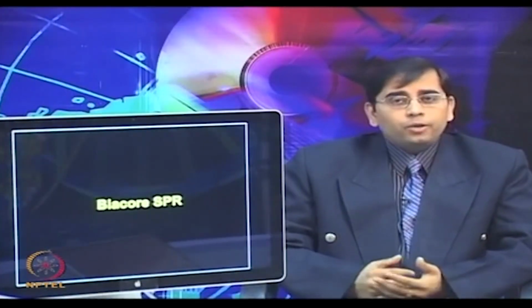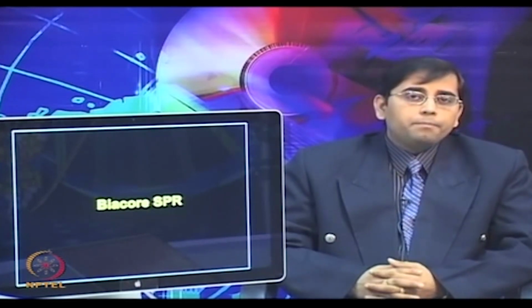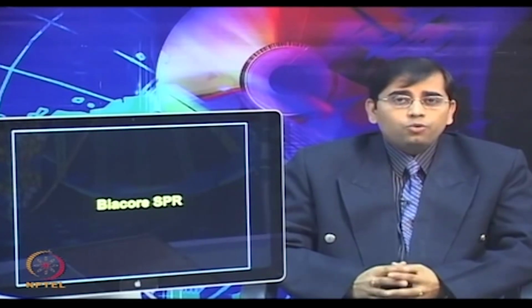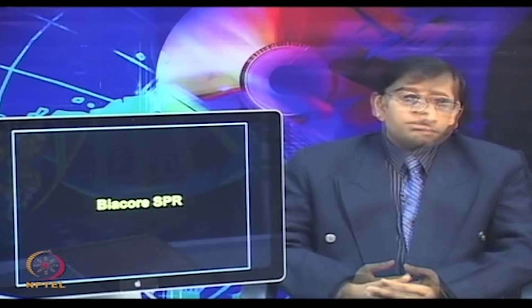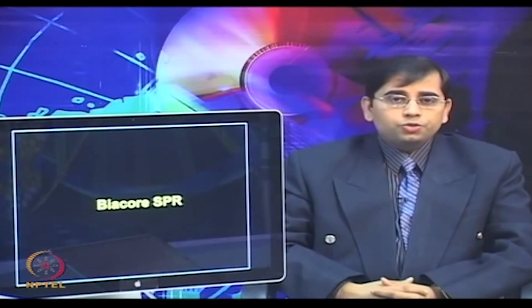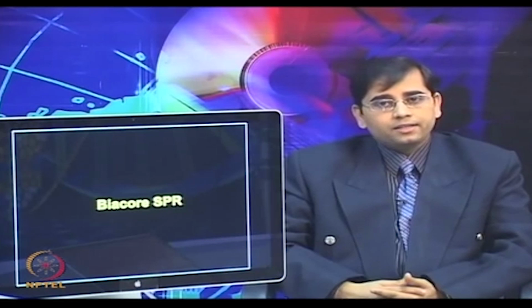Biacore are optical biosensors which can be used to monitor macromolecular interactions in real time without the need to label the biomolecules. The Biacore is a versatile platform to determine the kinetic rate constants for a variety of interactions.